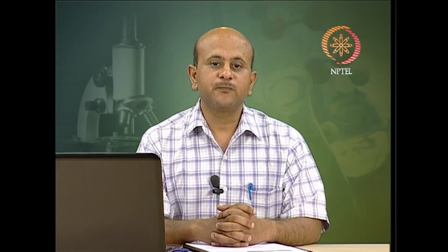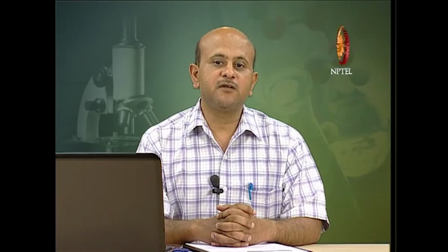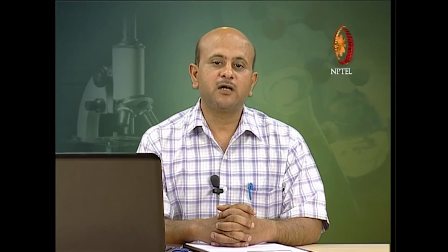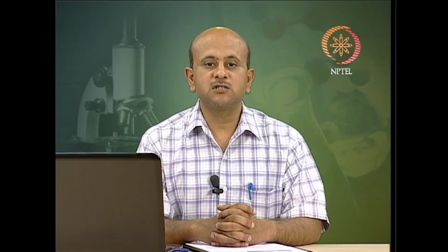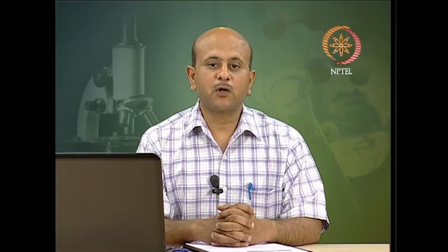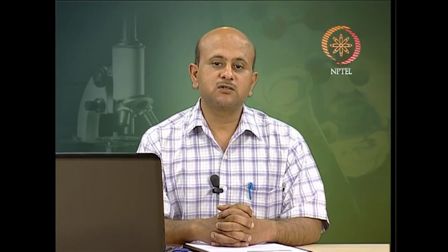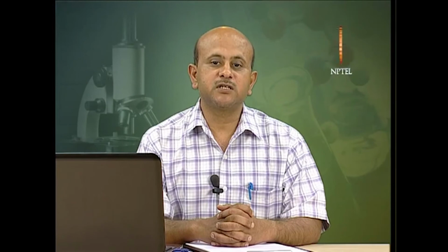Now, fixation. Specimens are generally fixed with solutions containing alcohol or formaldehyde or acetic acid. What is the role of this? What these compounds do is they denature most proteins and other macromolecules, and formaldehyde also cross links amino groups to adjacent molecules.